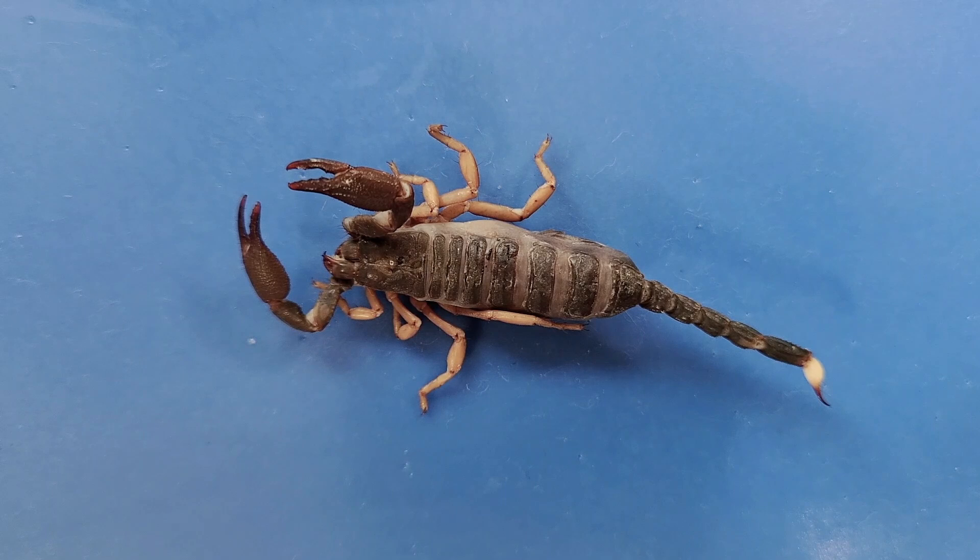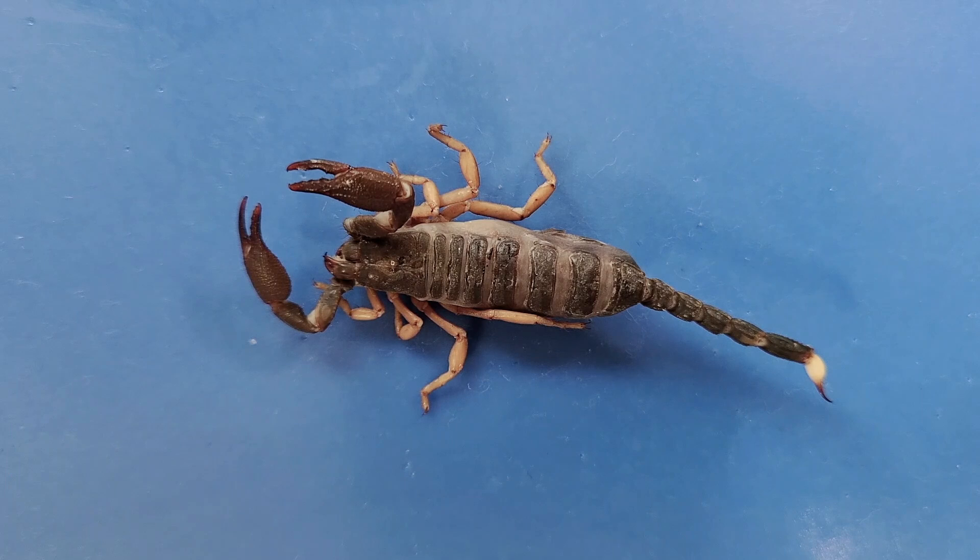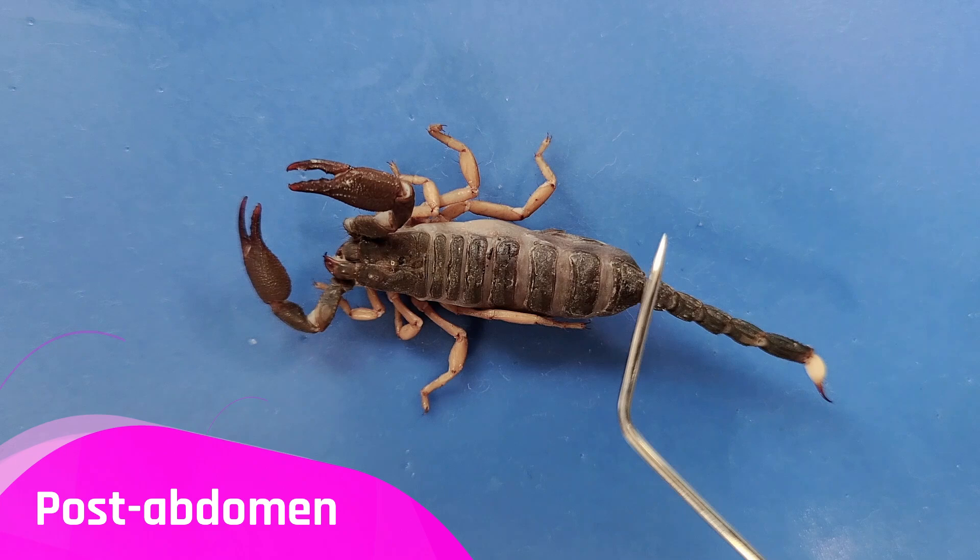The scorpion can be divided into two parts, or tegmata. The head, also called the cephalothorax, and the abdomen, which is everything else. The abdomen can further be divided into the pre-abdomen, here, and the post-abdomen, which is here.